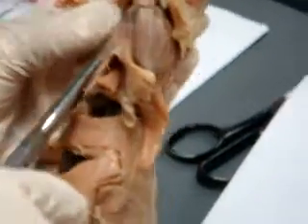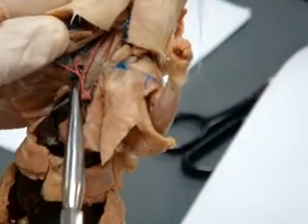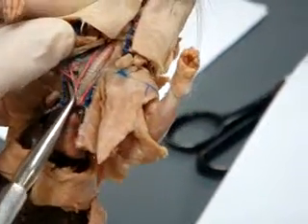See that little pink one that's running right there? Wait, no, it's red. Right there. Different rat. The one going straight back. That one's costocervical, vertebral. Let's see if I can find another one.